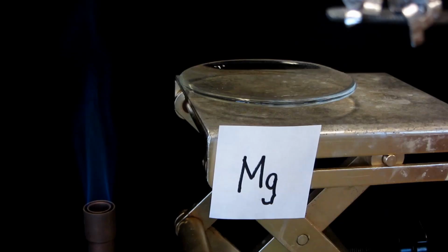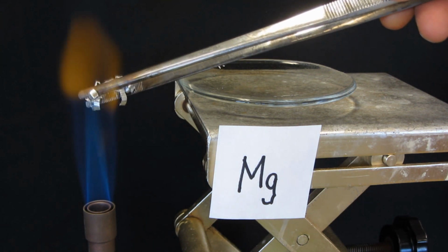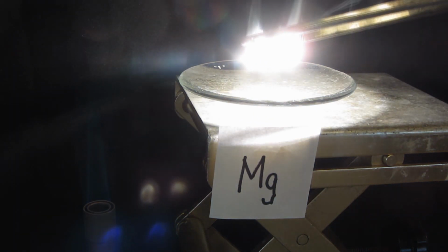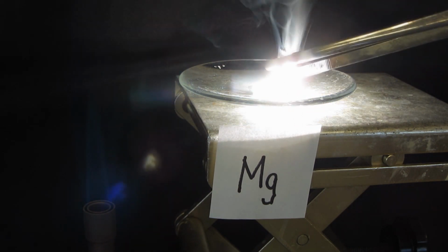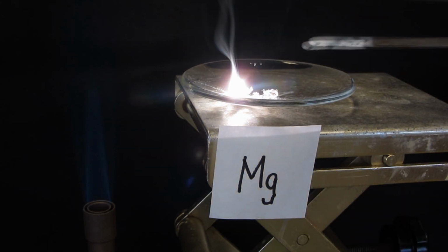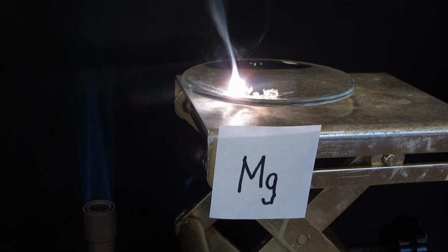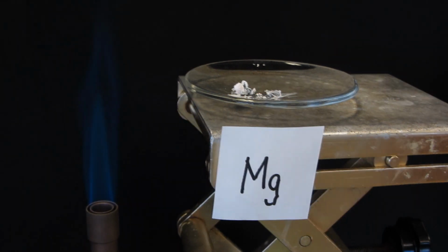Let's watch this reaction. I'm going to use the heat of a Bunsen burner flame to initiate the burning of magnesium metal turnings in air. Now, this is a combination reaction in which magnesium metal combines with oxygen gas, producing an ionic compound, magnesium oxide. Now, the literature says the temperature of this reaction exceeds 3,000 degrees Celsius, and I believe that based on the intensity of the white flame. And I also noticed at the end of the reaction that some of the surface of the watch glass was melted.